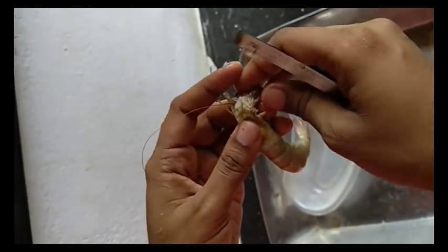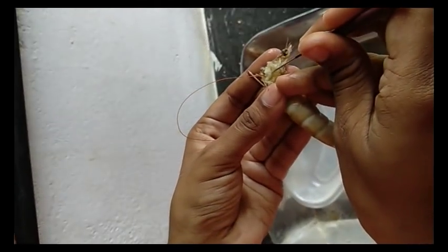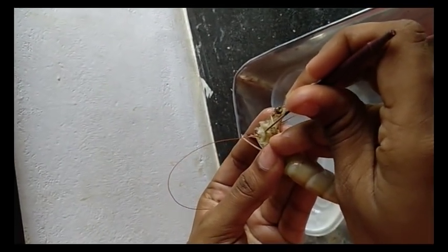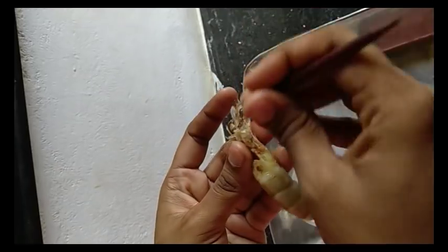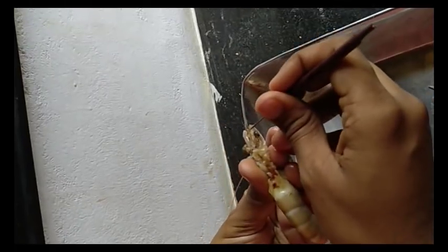Slowly, here you can see the supraesophageal ganglion. See, the tip of the needle points to the supraesophageal ganglion, otherwise known as the brain of the prawn. Now, above that, you can see two nerve cords which go into the eye, called optic nerves. So, I am going to trace a little bit of optic nerve.